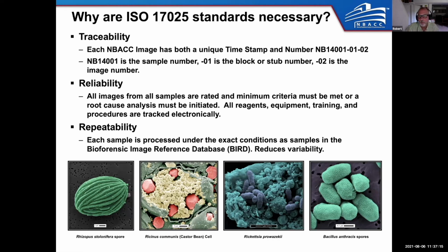So that when we get reagents in, we actually have to lot test them to prove that they are acceptable for use, okay? And all the paperwork for every bit of this has to get uploaded to a digital program called LIMS, Laboratory Information Management System, so that the clients can access this in real time.